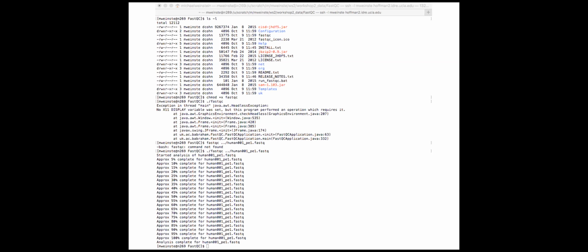So you should be able to navigate to that folder with the following link. You'll just need to replace the stuff I have in brackets. So it's /u/scratch/ the first letter of your username / your username.